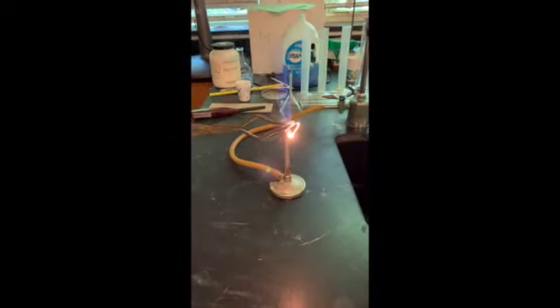All right, as you can see, this reaction gives off a huge amount of light. It is an exothermic reaction. We're going to come in close here. Now, Maurice, we want to just tap that on the lab station. See, we have turned this into a white powder. And that white powder is magnesium oxide. It is a powder.